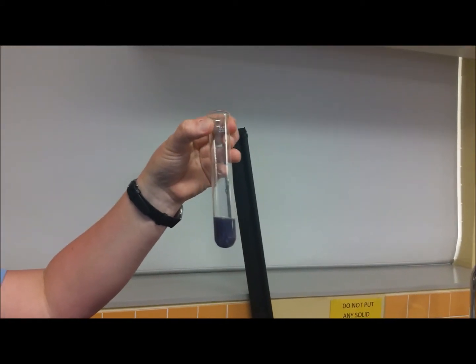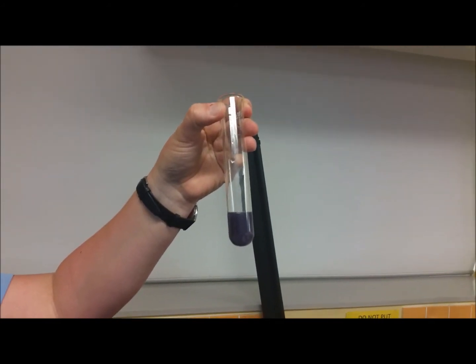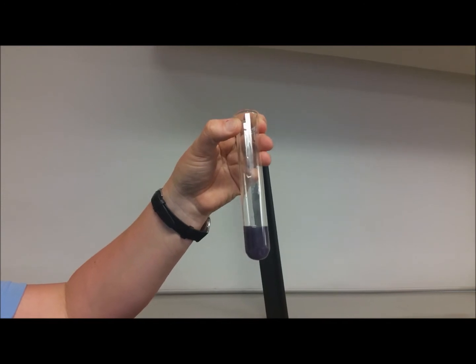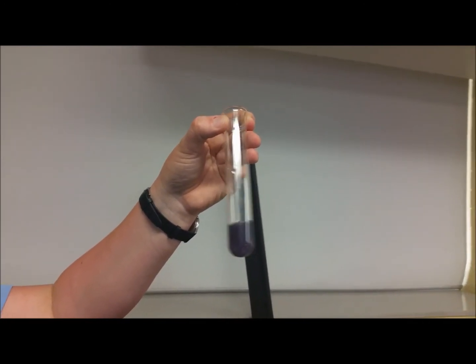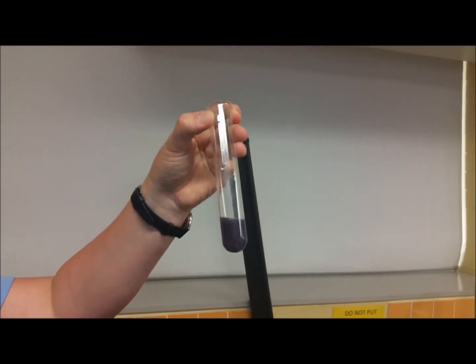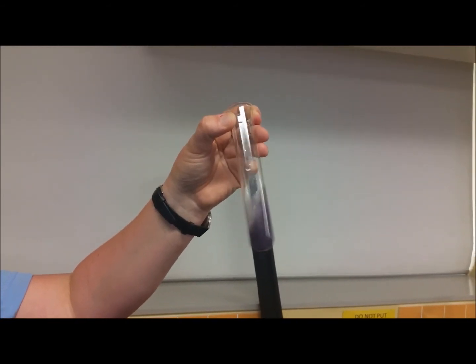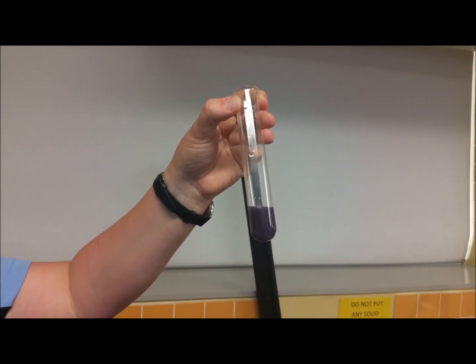We describe the color for a positive test result for starch as being usually like a purple black or a blue black. And I'll bring it around to show you as well. But if starch is present in the foods that you test, when you place iodine onto it, you will see that blue black color appear that tells you that starch is actually in it.